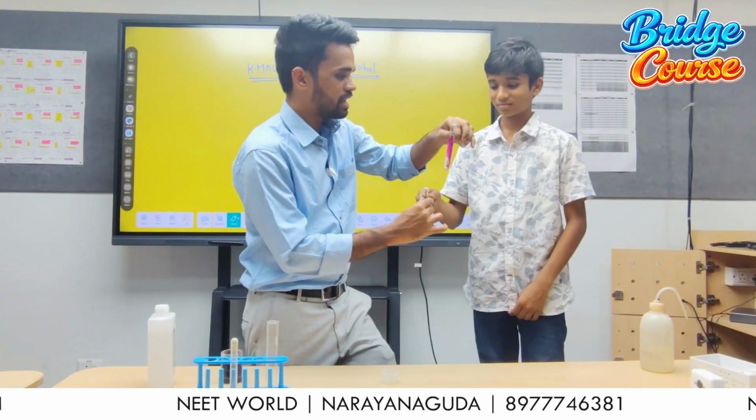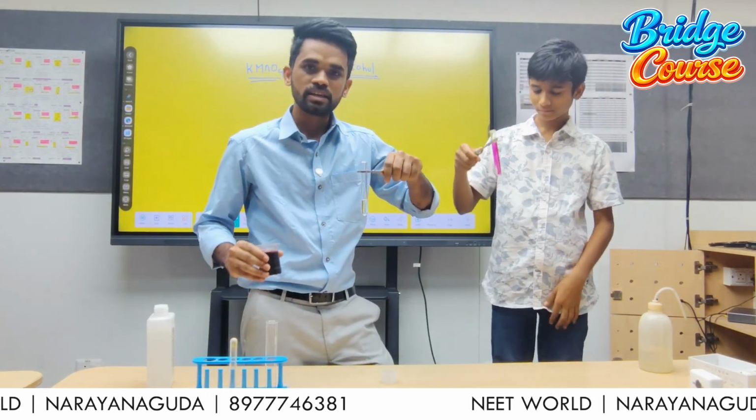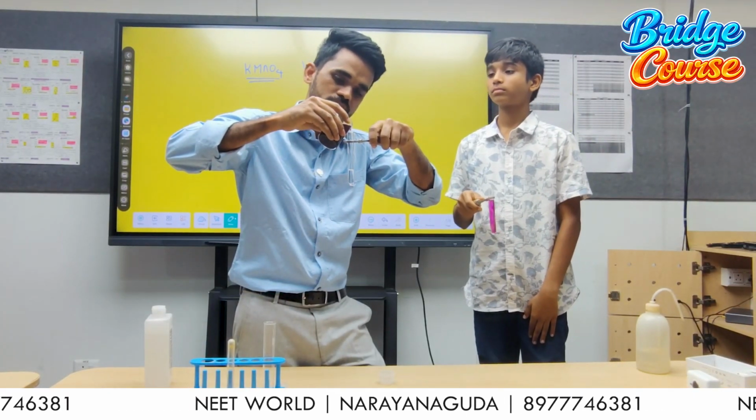See, yeah, Harish, you can catch this. Now to this, here I am adding KMnO₄. Let's see what happens.